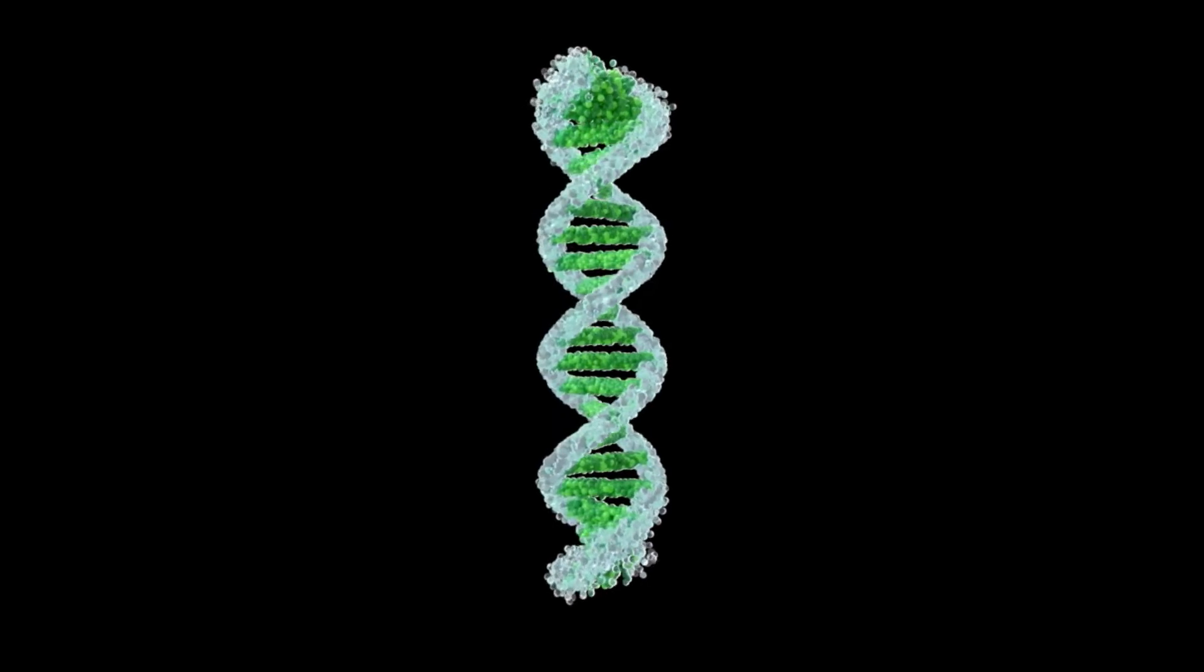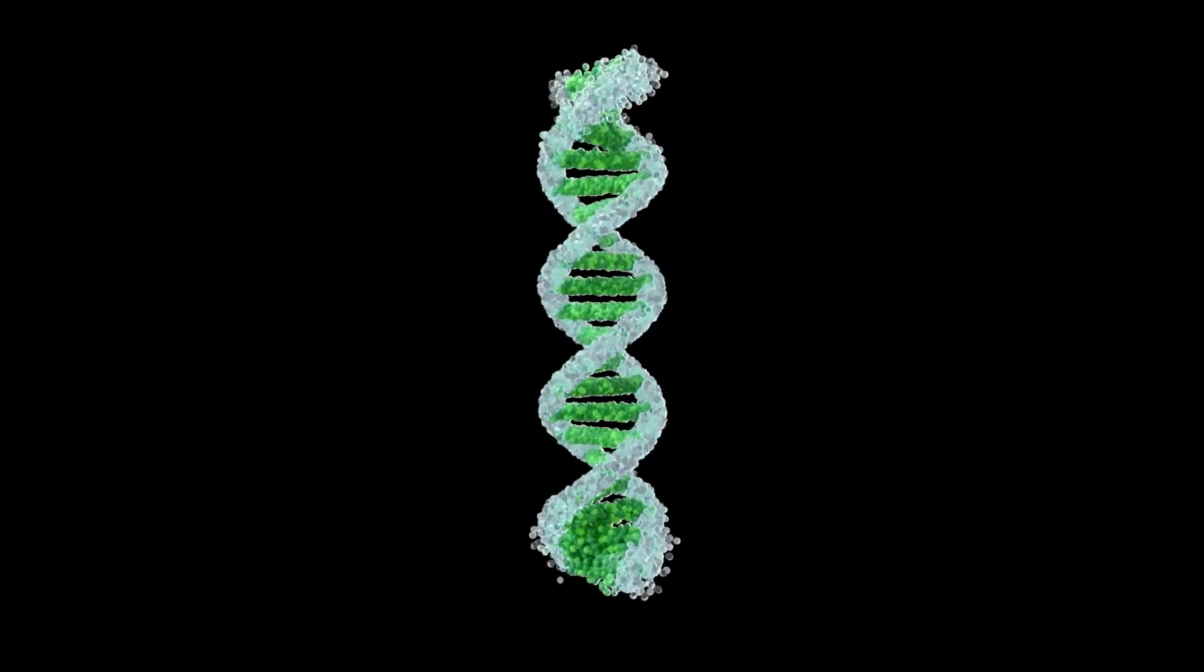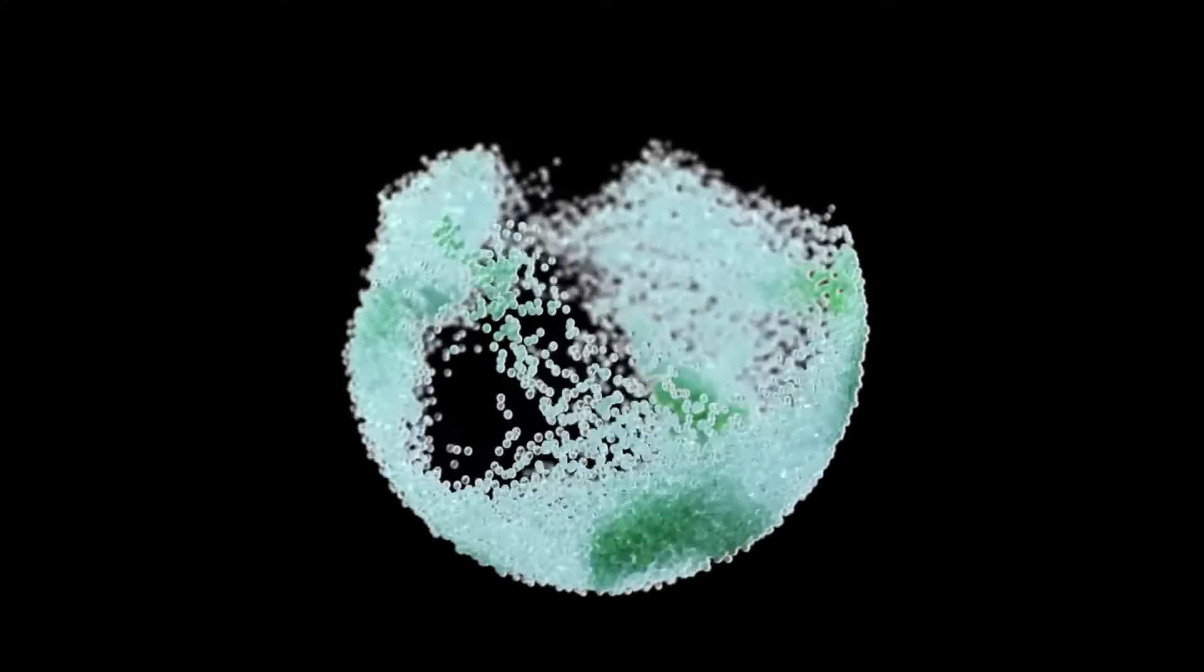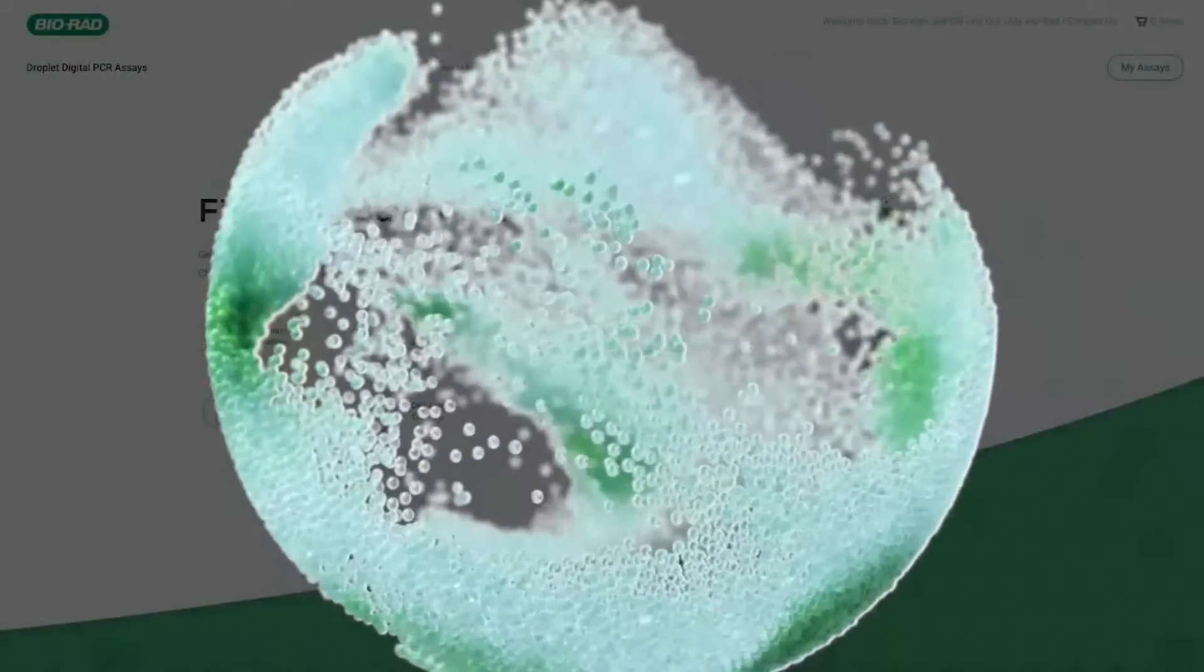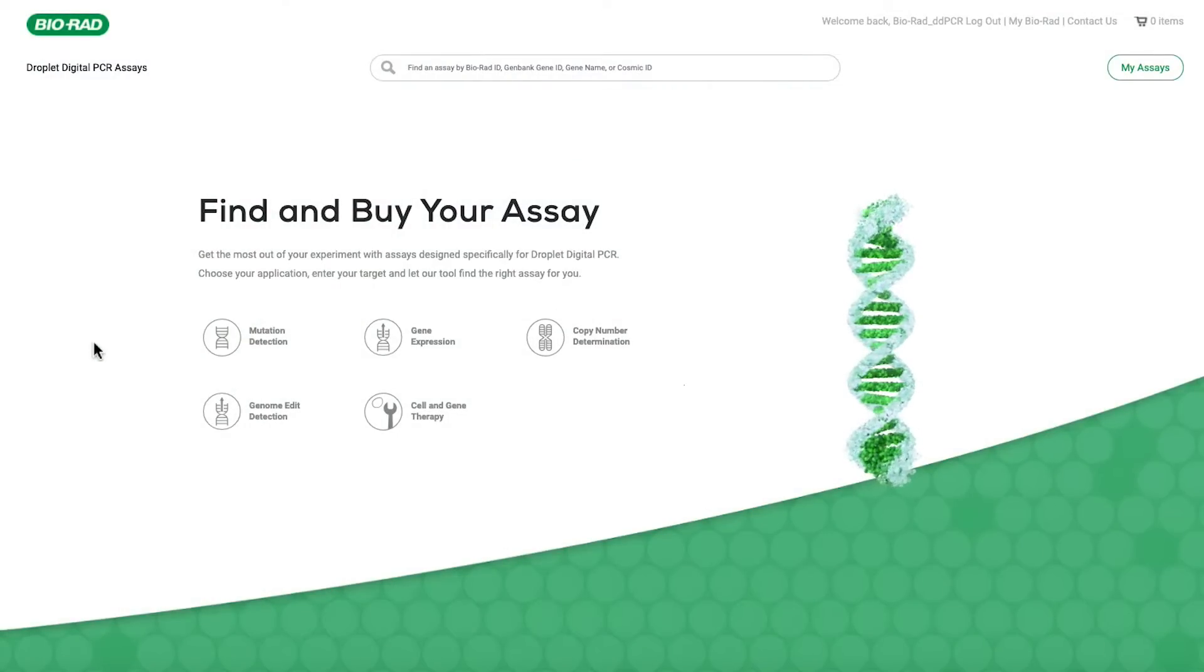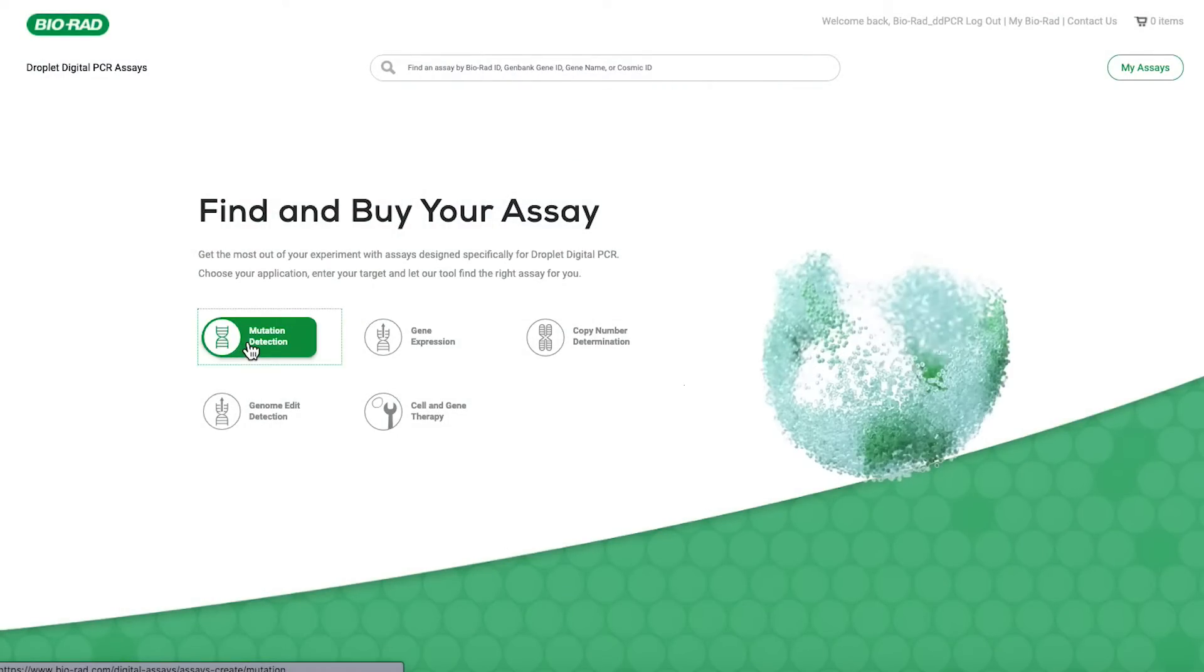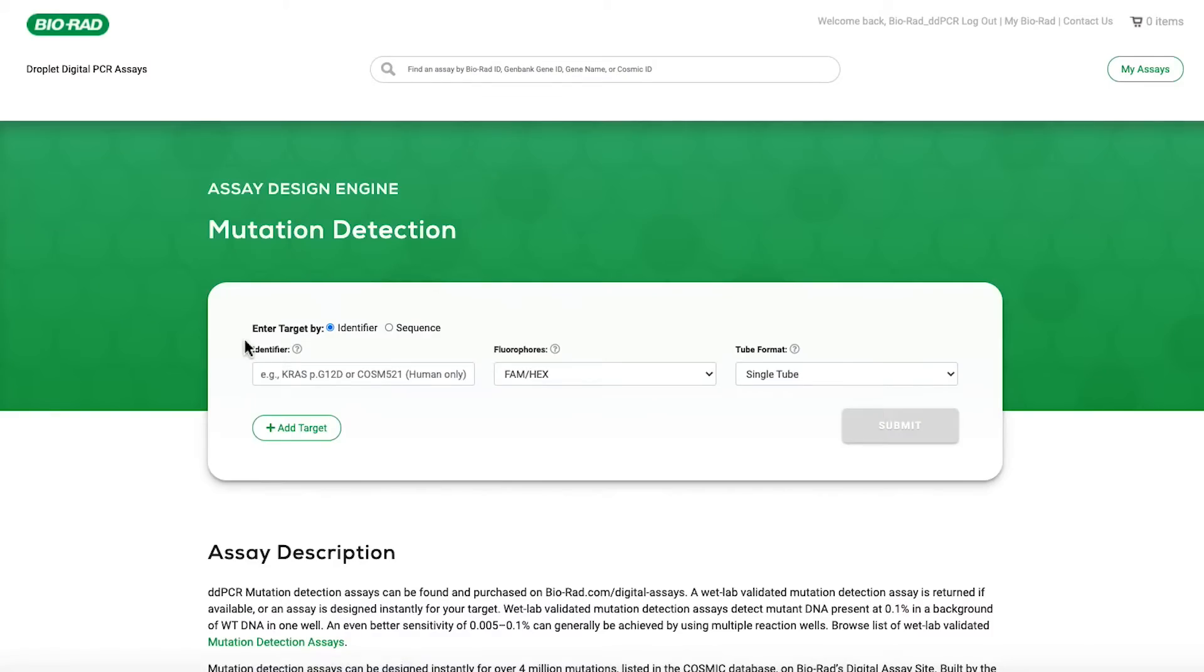Manually designing droplet digital PCR assays for mutation detection can be time-consuming. Speed up your workflow with the mutation detection assay design engine. Use the intuitive engine to find pre-designed wet lab validated assays or design and order custom assays optimized for DDPCR.